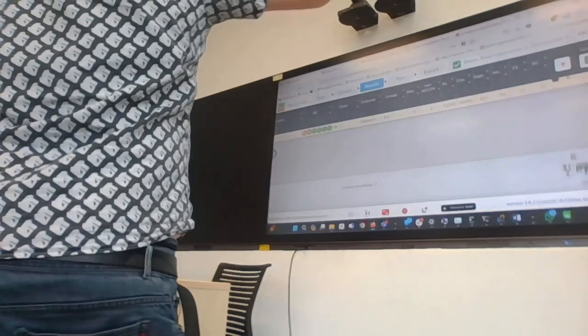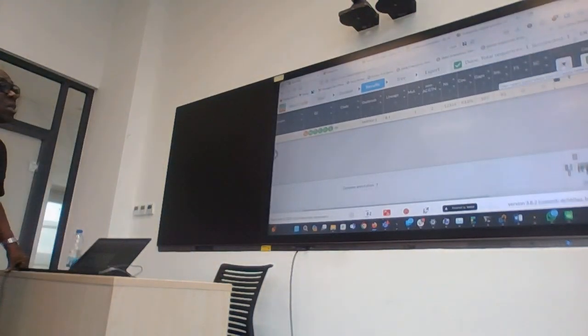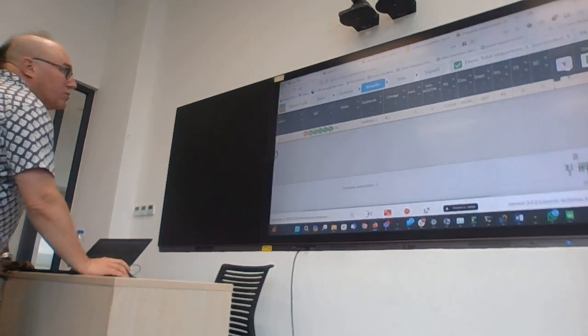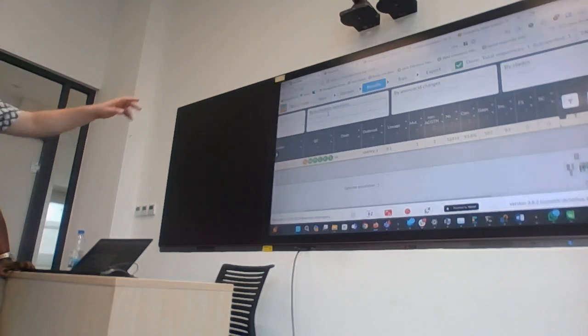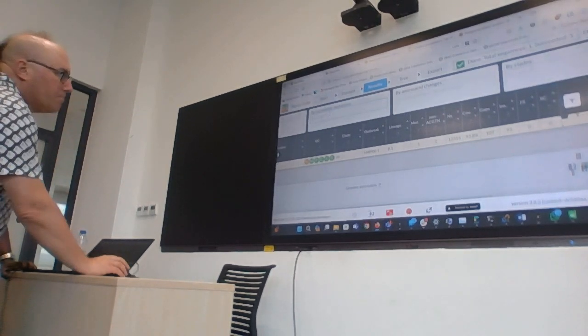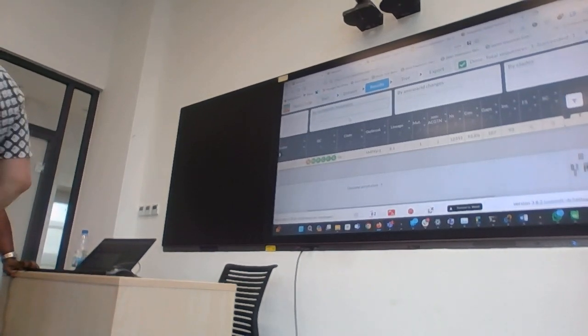The filter is just to filter if you've got more than one entry. If you can load 20 different things into Nextclade, if you go to filter, it filters the rows. It only makes sense if you've got lots of samples there.